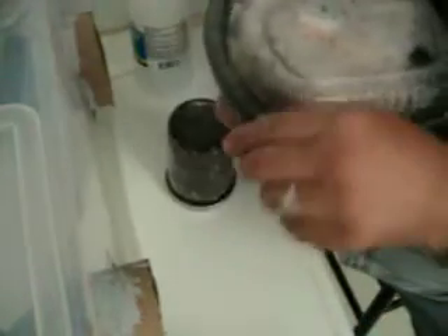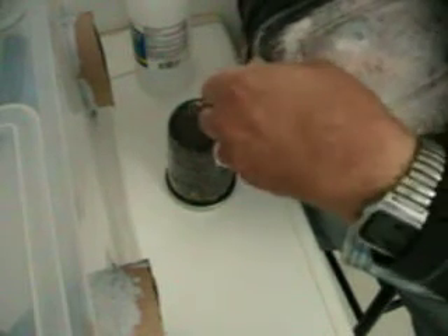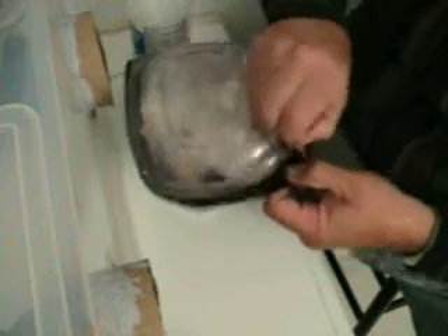Here is another container of blue oyster mushroom pieces — good seal. This one is covered with nice mycelium, so it will be ready to put in a growing media soon.